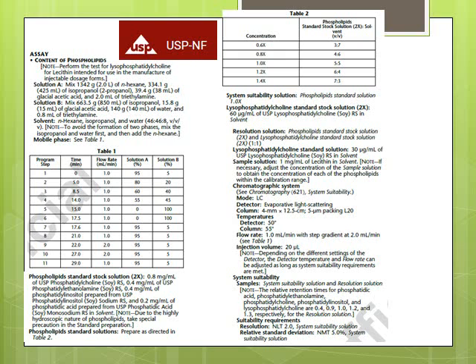And it is for raw material testing. I have to admit that I've never used this method. The main reason is that it requires the L20 column, which is a special type of column. It is silicon, and they probably put propylene glycol, something similar to propylene glycol, on the stationary phase.